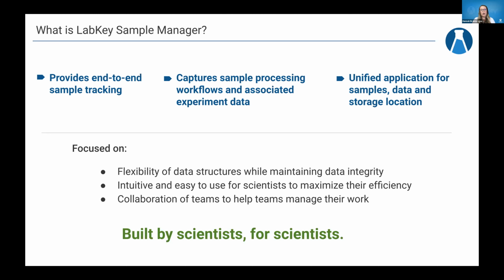As I mentioned before, this was really built by scientists, and not just me. We have a product advisory council of scientists that help us determine what is the most useful thing for them, and really sort of cross disciplines as well. And so this application was built by scientists for scientists, and we really want your feedback on how to be able to use Sample Manager in your lab.